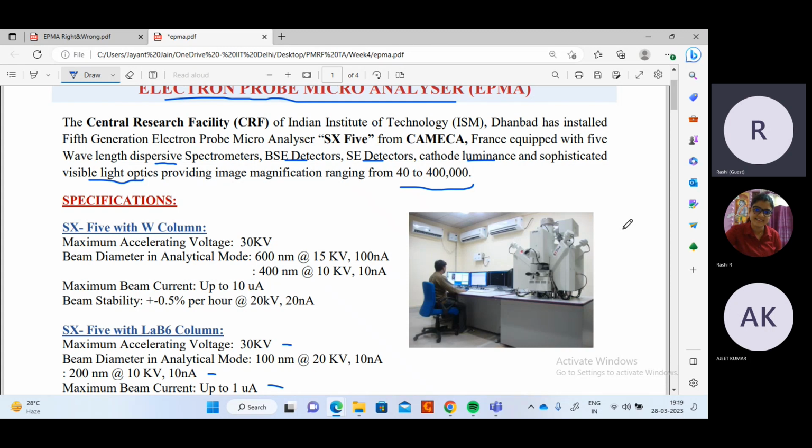And then with respect to that, when you do the analysis of the same composition sample, if you produce the same sample again and do the analysis, you'll get how much percent variation is happening. If it is within the allowed percentage, then you'll be fine with that. Else it will not be possible.